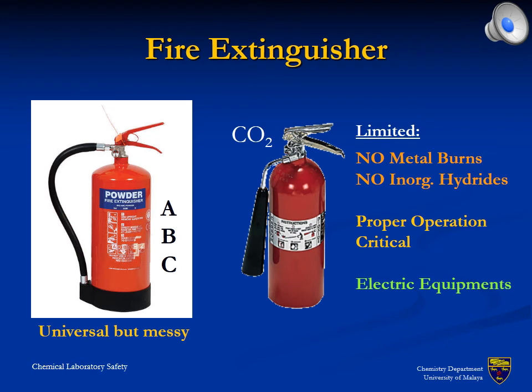There are two types of fire extinguisher available for chemical laboratories. These refer to powder, ABC, and carbon dioxide. Both extinguishers aim to block oxygen from reaching the fire, thereby stopping it. While powder is safe for practically any fire, carbon dioxide is not compatible with burning metals and organometallic compounds. On the other hand, it avoids damage to electric devices and should, therefore, be used if the fire is suitable. However, in doubt, powder shall be the choice, since the damage by fire typically exceeds the damage to equipment by far.